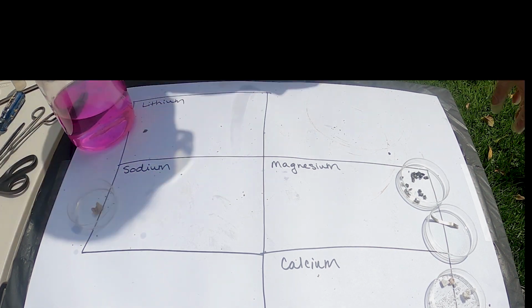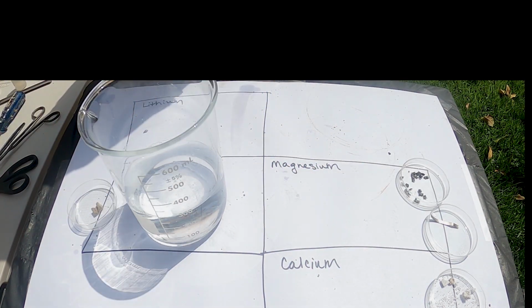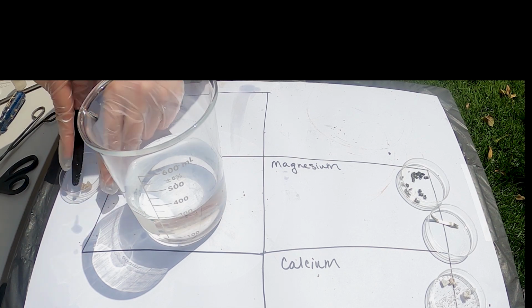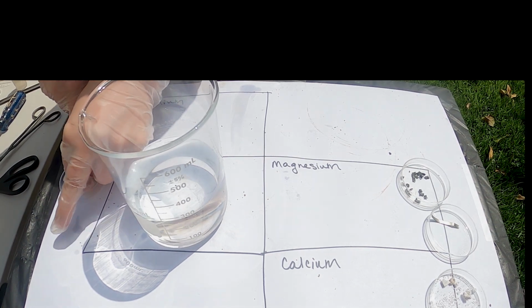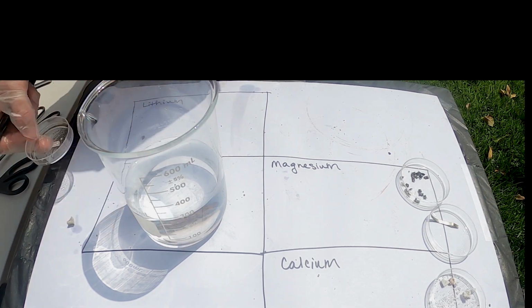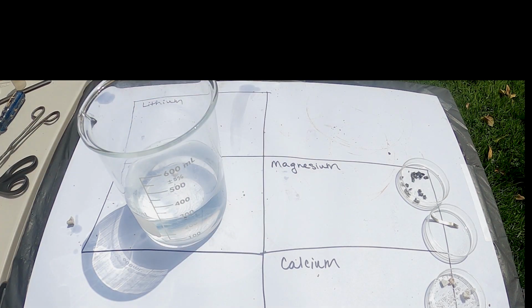Next, let's look at the reaction between sodium and water. Notice the very small amount of sodium that I have prepared here. I'm actually going to use only half of what I've cut, and you'll see why in a minute. All right. Woo! See, it fizzes up into a nice circular ball. Tons of smoke.